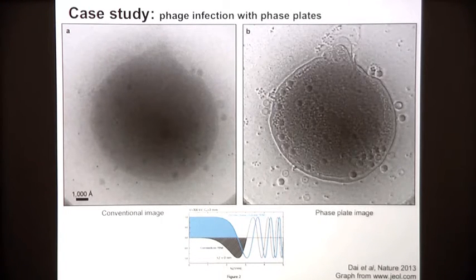Another exciting study that I would like to present is the use of phase plates to collect tomography data. So there are hardware improvements; the electron microscope is constantly being improved, and these hardware improvements benefit not only single particle analysis, but also tomography.